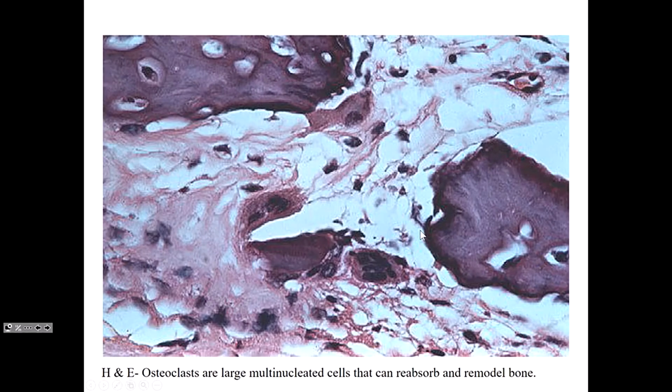Okay, here we can see now, look at this guy, multinucleated cell. If it's multinucleated, that means it is an osteoclast formed by fusion of monocytes, right? Multinucleated, that's a dead giveaway. So here's one here, this is maybe half a dozen or more nuclei. Here's another one, I can see at least 4 nuclei on that one. If you look carefully, you can see these osteoclasts. Any questions?